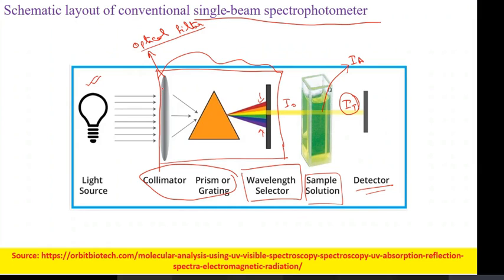Now there is one problem over here. What is the problem? For specific wavelengths, you have to get specific filters. So the number of filters that can be included within the colorimeter is limited. Usually 7 to 10 optical filters are included within the colorimeter.